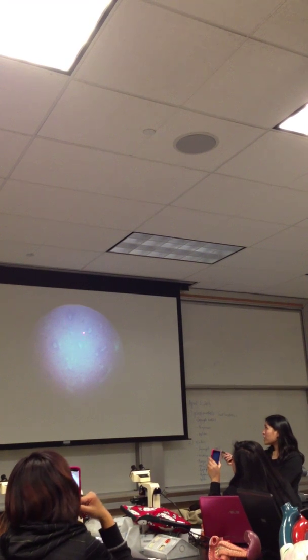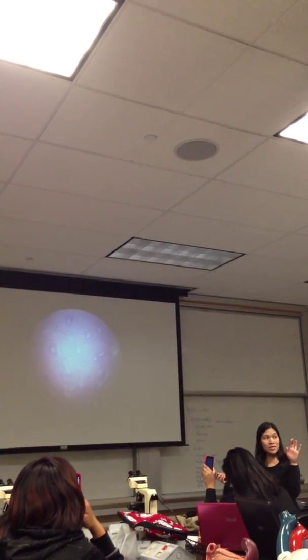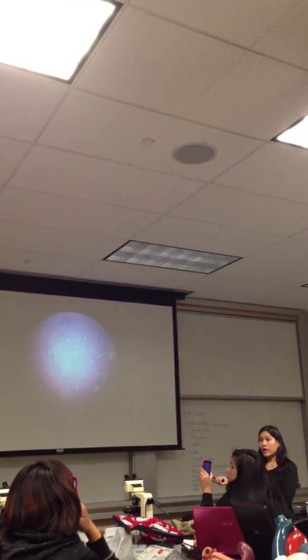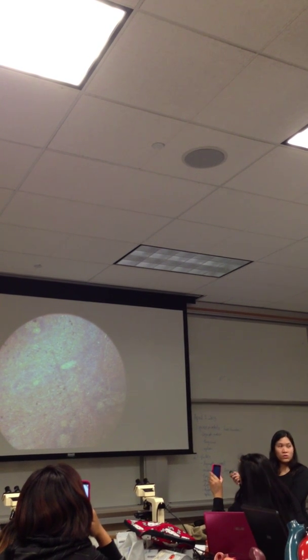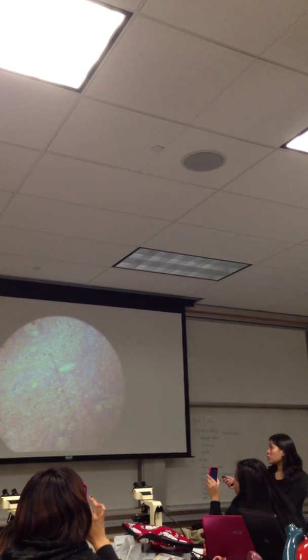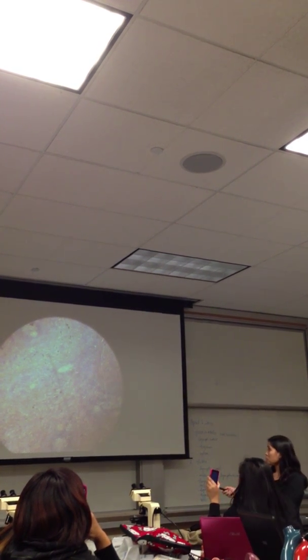Hopefully you will identify this and not confuse this with the lymph node. Remember, the lymph node has some white areas, but it doesn't have a contrast of white and red areas. So this is another view. See how it's like bruising, as opposed to the lymph node earlier, which is mostly pink, just shades of dark and light pink. But here you see light areas in the middle, and then you have the vast red pulp. Is that clear?